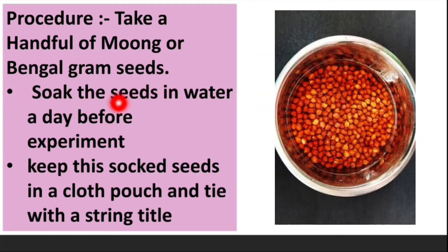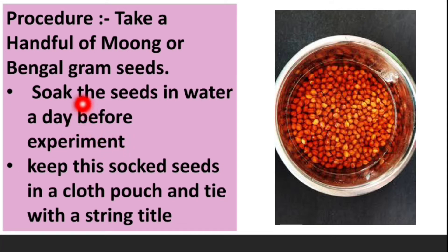Soak the seeds in water a day before the experiment. On the day of the experiment, take the soaked seeds out of the water.